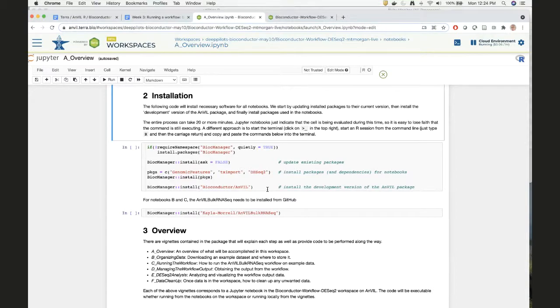And I don't want to do it in the Jupyter Notebook, because if I were to just press the carriage return here, it would evaluate these commands and indicate that it was running with the little asterisks. But all the time that packages are being installed, it would just sit there and be completely boring, and you'd lose confidence that it was actually running.